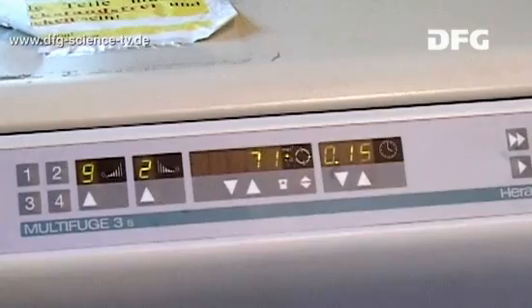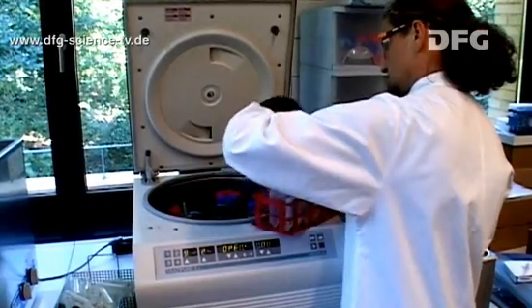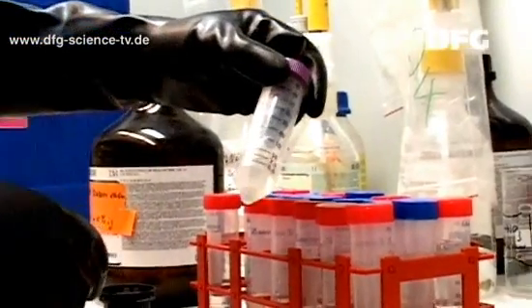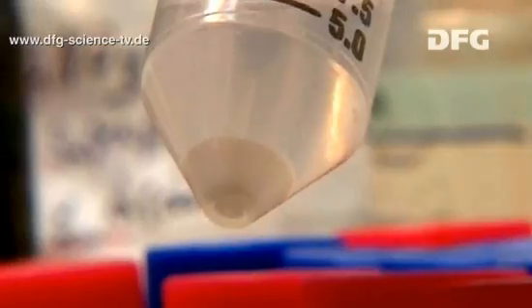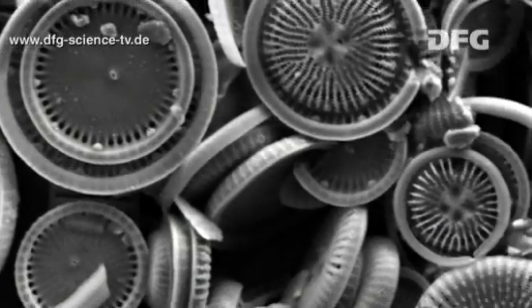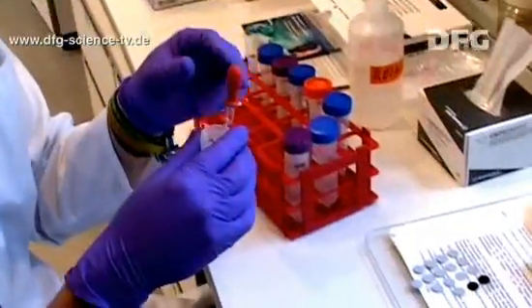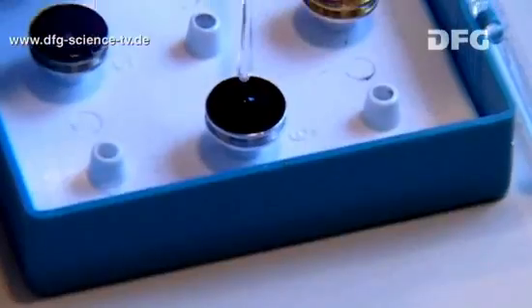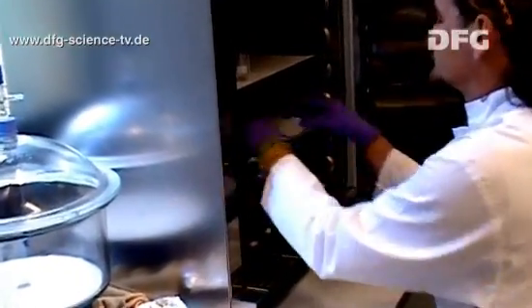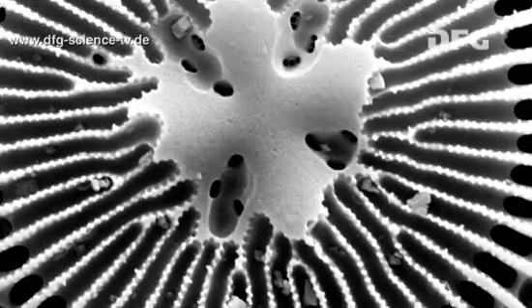A centrifuge separates the diatoms from the added fluid at 2500 rpm and washes out the acid. This process is repeated 6 times and results in a purified diatom sample from which the supernatant is decanted. The remaining algal skeletons are dried and readied for contamination assessment. So-called stamps are prepared for the scanning electron microscope in order to examine the purity of the samples. This microscope allows a theoretical magnification of up to 1 million times.